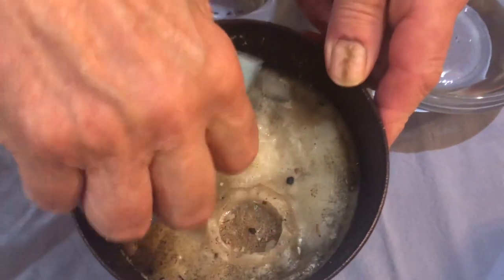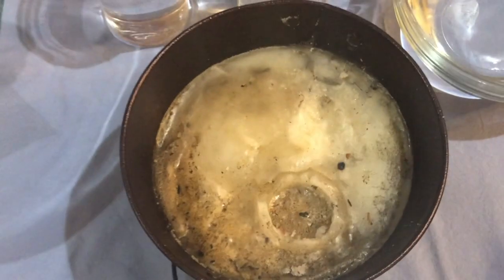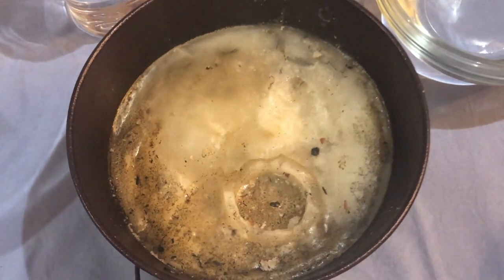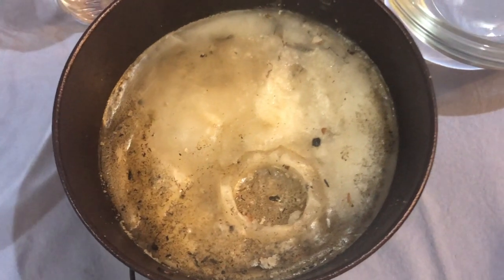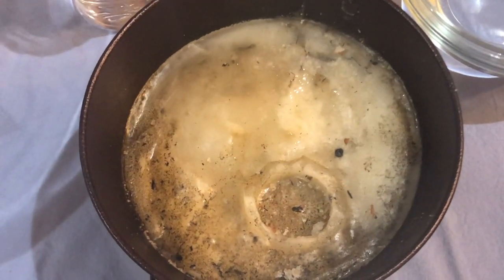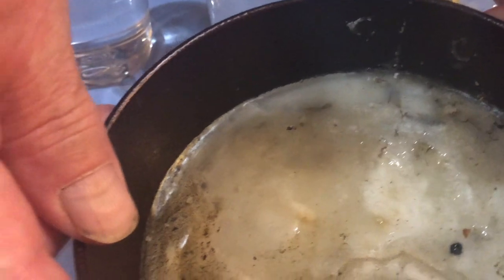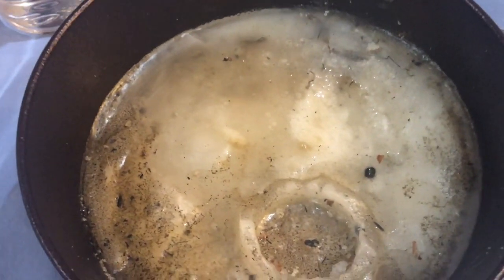Let's look at something else I have right here. Okay, I'll wipe that out. Now let's try some isopropyl alcohol, which you know is rubbing alcohol. You've smelled that many times in class, passing that around, okay? So we'll put some of that on there. And I don't know if you can see, it's hard to see, but no matter what I do with it, it doesn't ball up. It does not make those round little beads that water does.